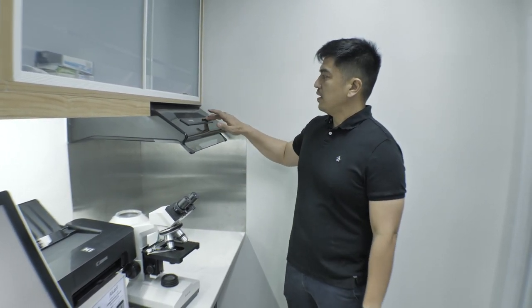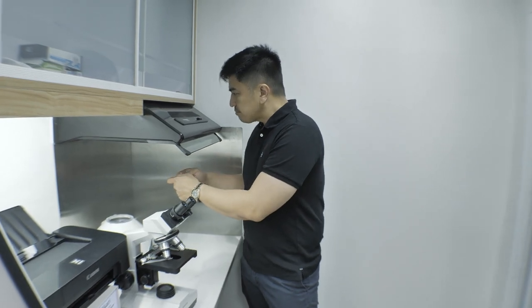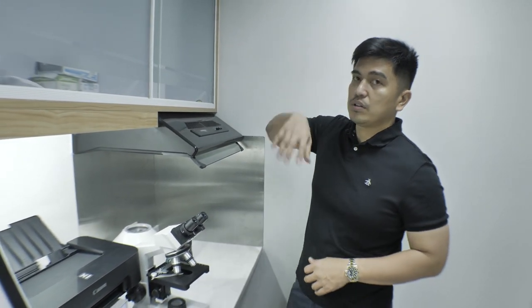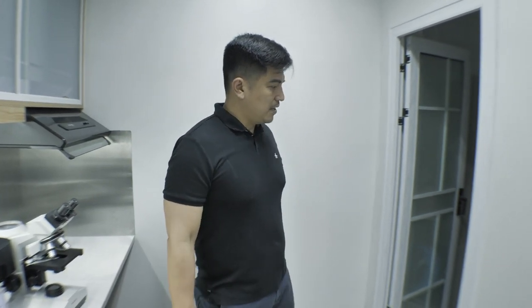So, yeah, so we do a lot of chemo. Oh, wala pa siyang power supply. So we do a lot of chemotherapy and prepare them here so that it will be suctioned out palabas doon. The vet or the personnel who's going to prepare the drugs will not be able to inhale the fumes or, you know, touch them because it's very sensitive. It's very important that you don't.